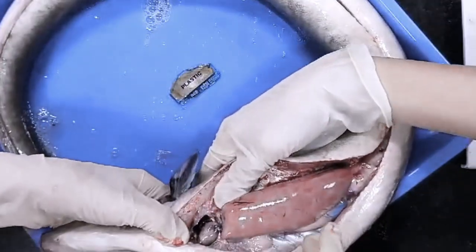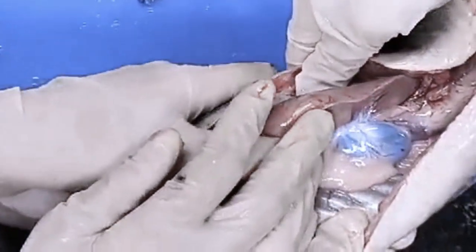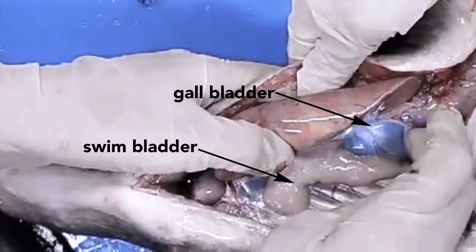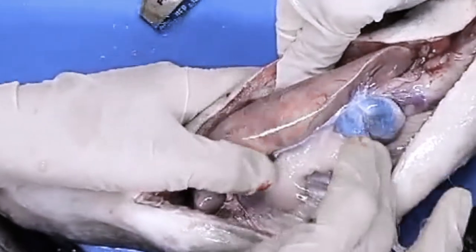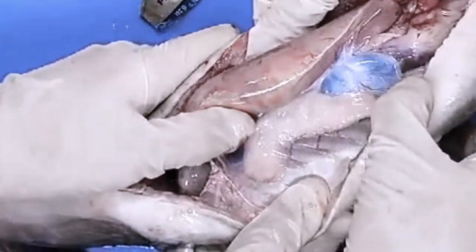The large organ right under is the liver, then under that, we can find its gallbladder and its swimbladder. The function of the swimbladder is to control the eel body's ability to float while swimming.